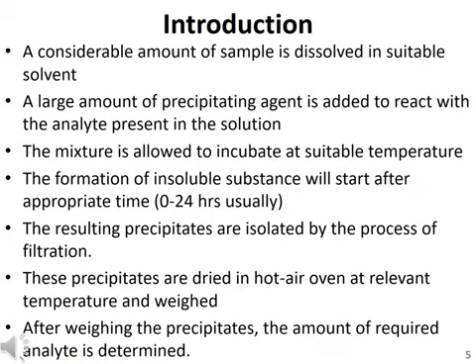And the temperature of the hot air oven is very important, as if we are working at a higher temperature, then the higher temperature will burn the precipitates. And if we choose a lower temperature, then this lower temperature will take a lot of time to dry these precipitates.